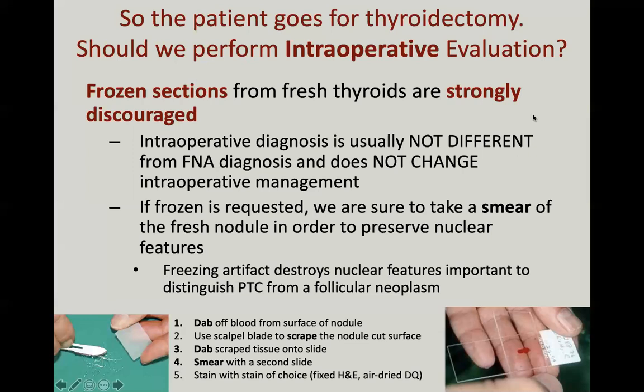So what we've done for both thyroid and salivary that require intraoperative evaluation is, rather than serially sectioning it like we normally do grossly on permanent, we've taken a somewhat different approach, which is to bisect it longitudinally and open up the face. So now you have two halves, and take your smear or your frozen from that face, like they do with the tissue bank prostates. Then you can actually pin it face down and pin the periphery or the capsule, even though thyroid doesn't have a capsule. Pin it to wax.